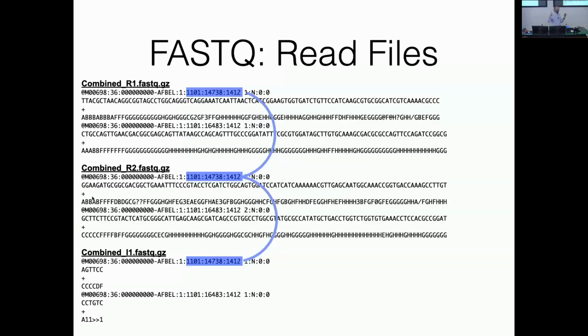You're going to make new files, usually per sample. And so this read is going to go into the R1 sample 3 file. This read will go into the R2 sample 3 file. And usually once you demultiplex, you don't care about the index barcodes anymore, so you just throw them out. Then this read will go into the R1 sample 12 file. This read will go into the R2 sample 12 file, and again, you can throw out the index barcode.